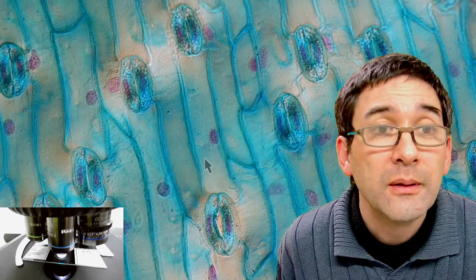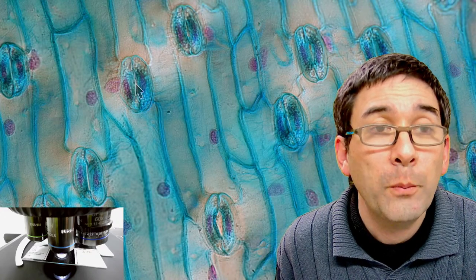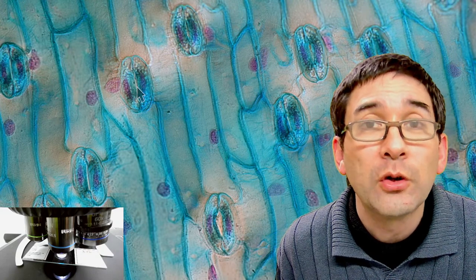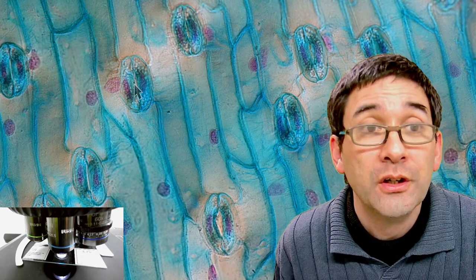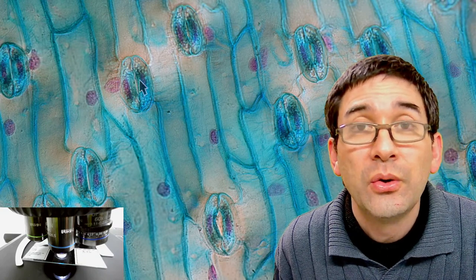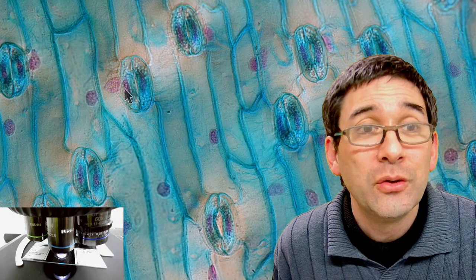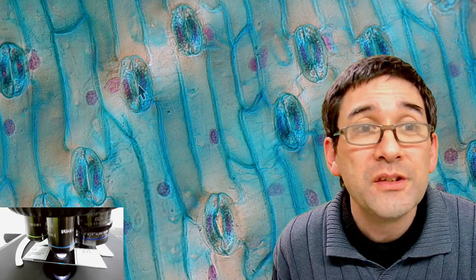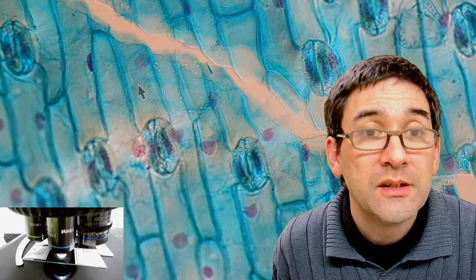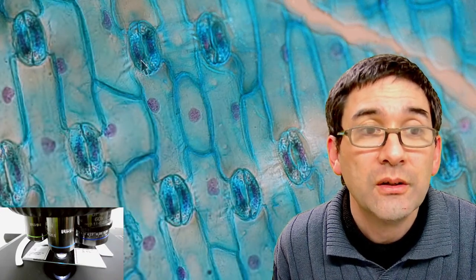Now you're actually able to see this much better. The guard cells — the two of them — and in the middle an opening. The importance here is the following: in many plants the stomata, the openings, are going to close during the night to prevent loss of water. Those guard cells are responsible for opening and closing the hole in the center, so that gases are able to enter during the day like carbon dioxide from the air. During the night it closes so that water vapor is not going to be unnecessarily lost.